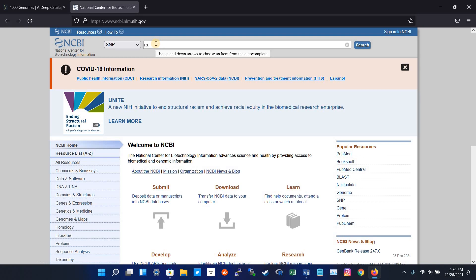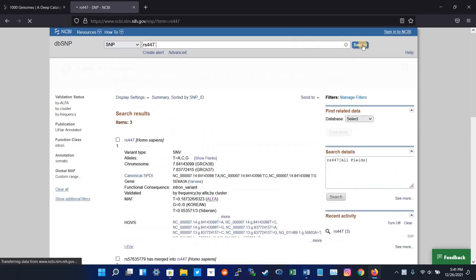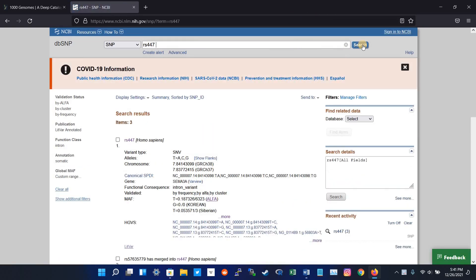For example, I want to see the frequency of this variant RS447 in Thousand Genome. So let's search. Here I got the results. I click this ID for Homo sapiens.